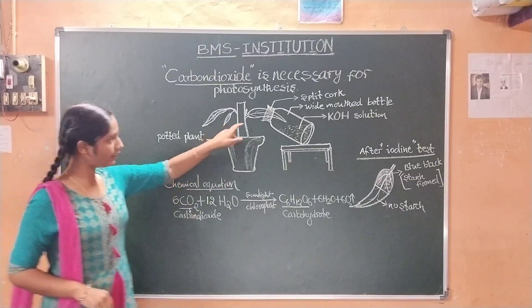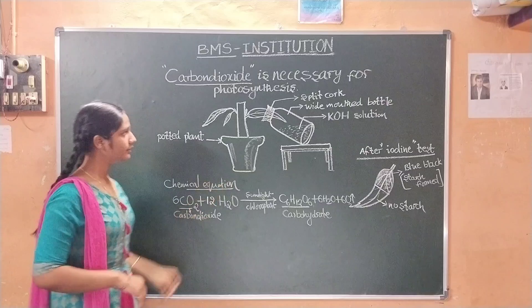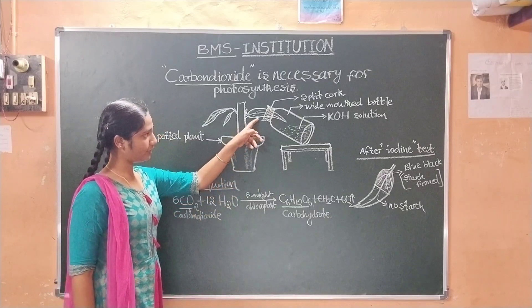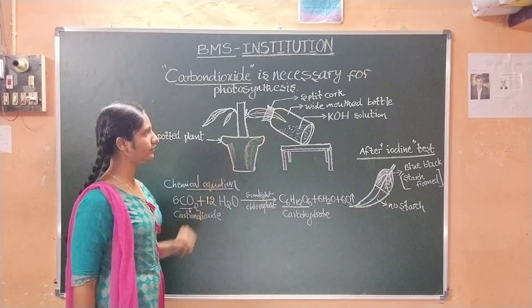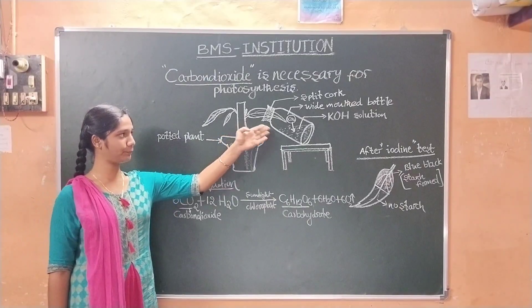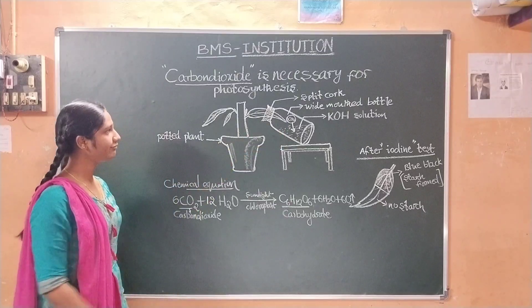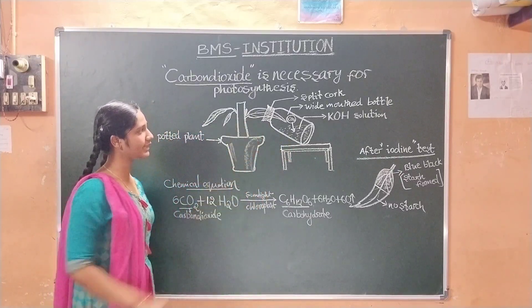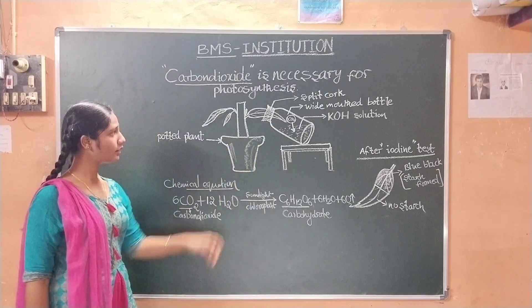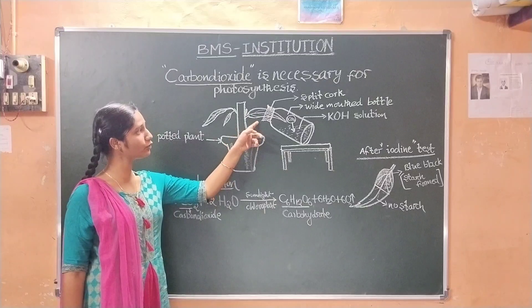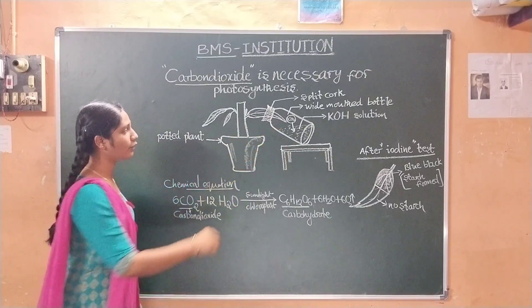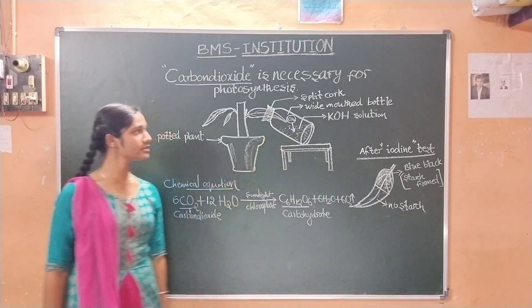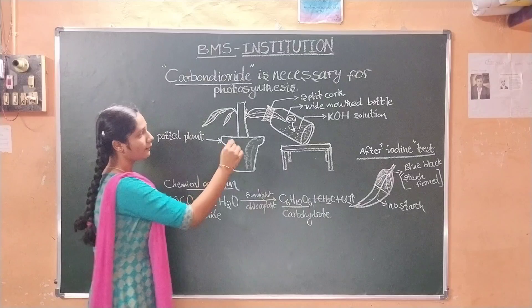Now we have to select one of the leaves from this potted plant. I have selected this leaf and inserted it into this wide-mouthed bottle. We have to select a long leaf to put into the bottle. Before that, we have to pour some amount of KOH solution into the bottle. Then we place the leaf carefully, keeping only 50% of the leaf inside. After this, we fill the mouth with the help of a split cork.